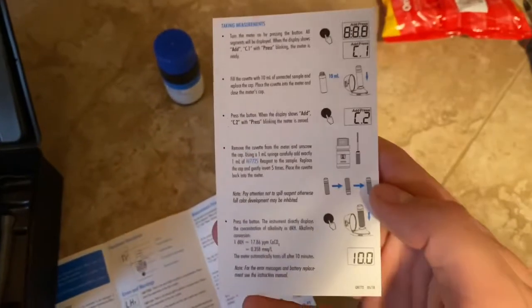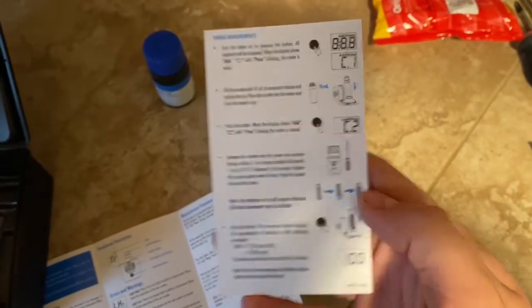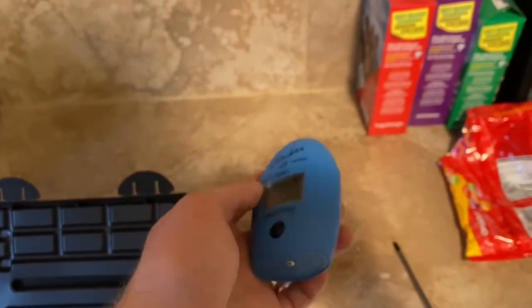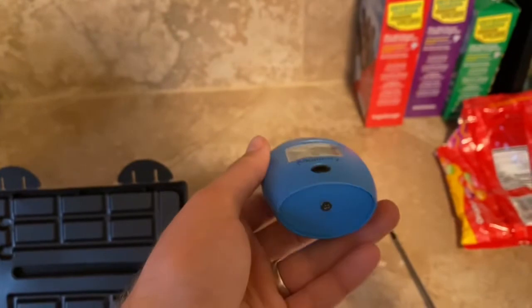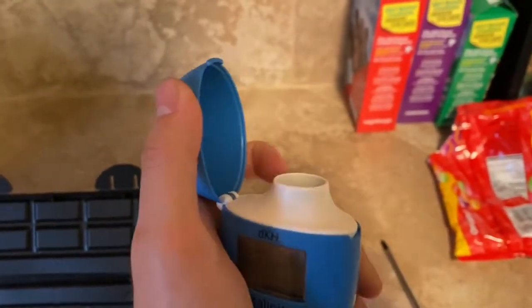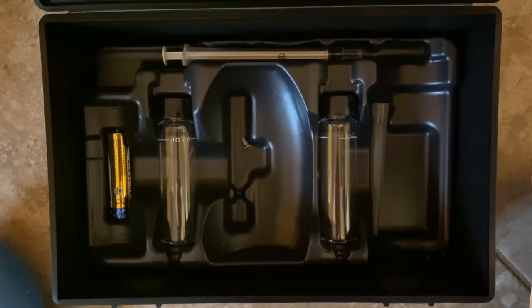This is basically another run-through of the procedure. Here is the checker — you're going to have to take the little screw out and pull the bottom panel off. It's difficult to get off the first time; once there's a battery in there the spring helps eject it, but the first time you may need to pry it out. Be gentle because there's a small piece in there that you don't want to break off.